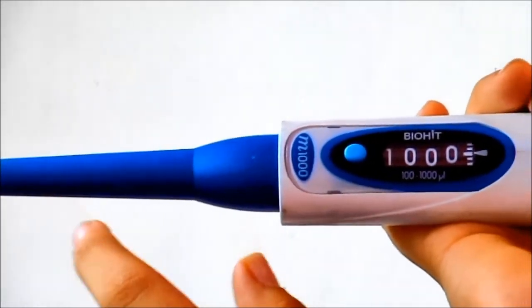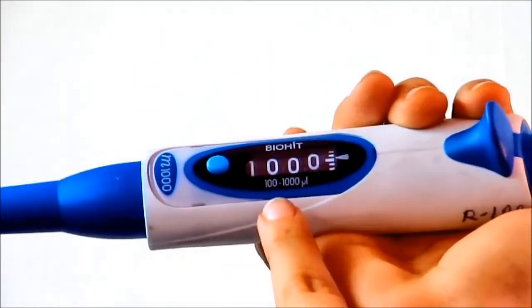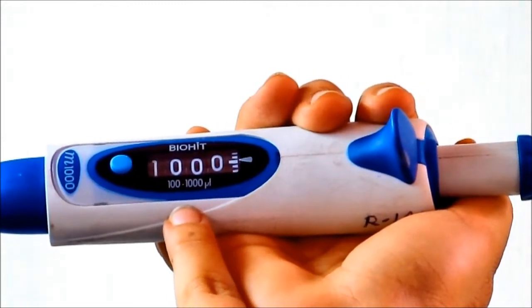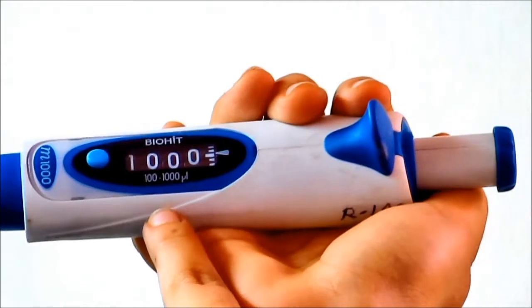Proceeding further we have a digital volume indicator that shows the volume that we adjust. Behind that is a tip ejector button.